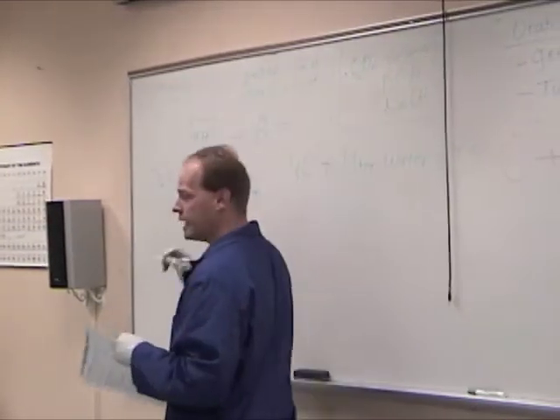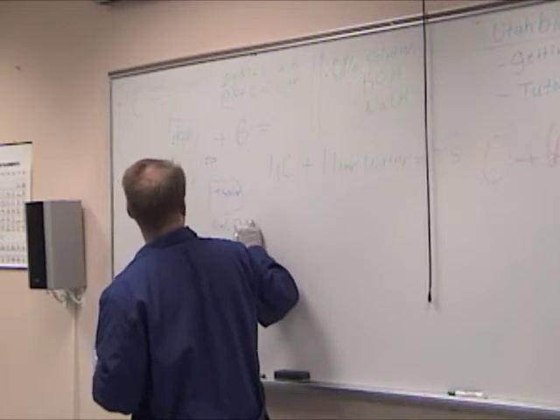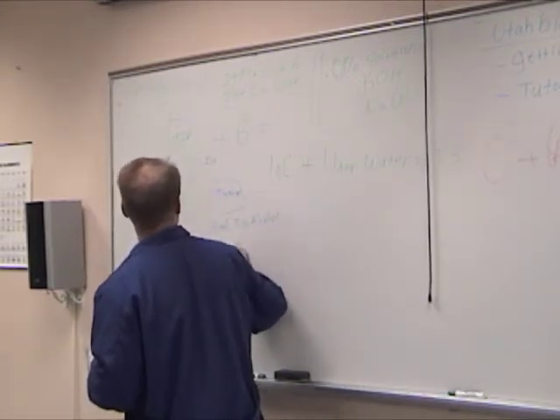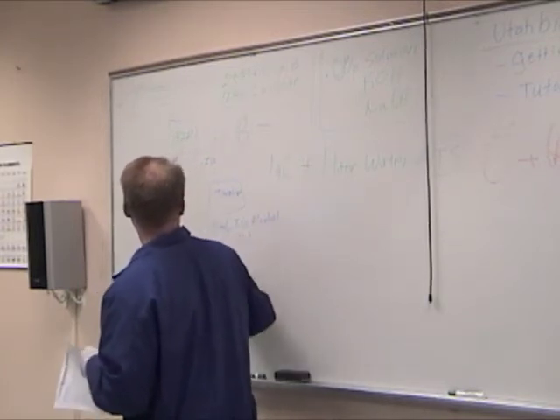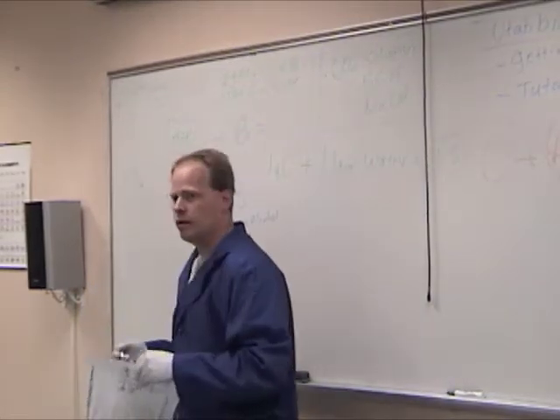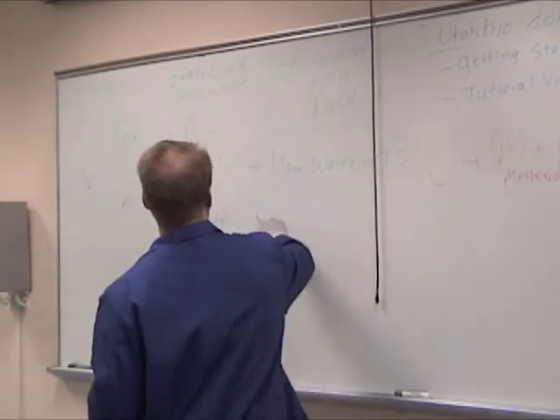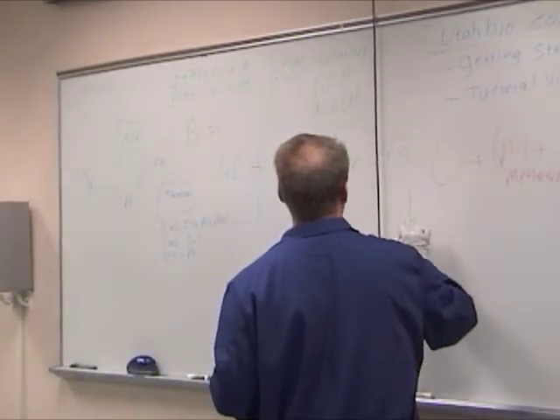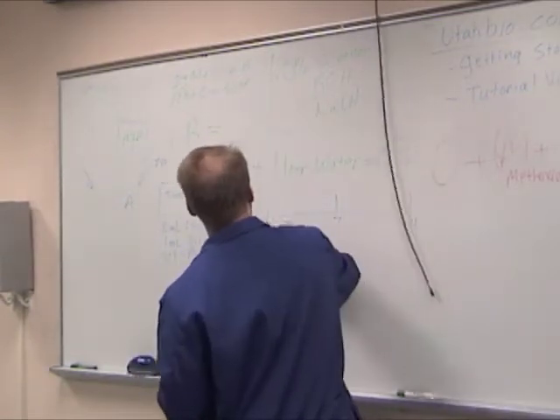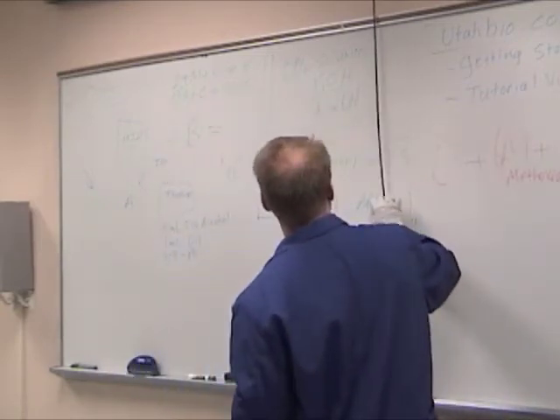The basic recipe for a titration is 10 milliliters of isopropyl alcohol, 1 milliliter of oil, about 2 to 3 drops of phenolphthalein or phenol red or turmeric or any kind of pH indicator that will indicate on a pH scale. Remember, you go from 0 to about 14, 7 being neutral. This side is acid. This side is base.